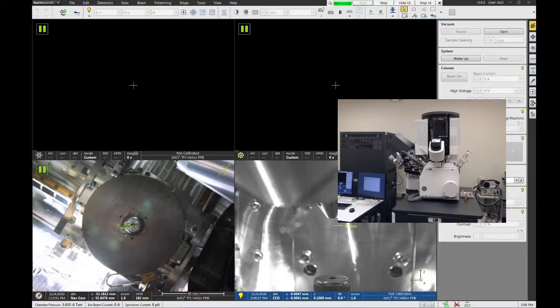Got it. Okay. So in terms of just SEM resolution, does this have any difference with the other Helios, or are they the same? The SEM columns are very, very similar. It should be nearly the same resolution. There are some small, subtle differences, but most likely you're not going to notice them. The big difference with the SEM on this tool is that it doesn't have a lot of the analytical capability that the Helios 650 has. It has just a TLD detector and an ETD detector, so it doesn't have the backscatter detector. It doesn't have EBSD.